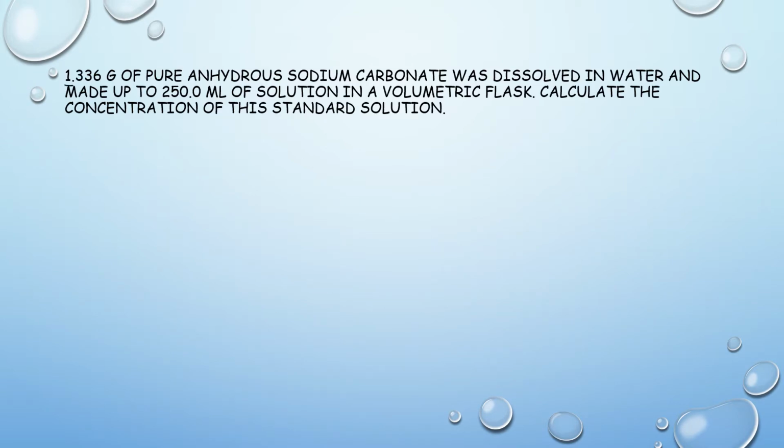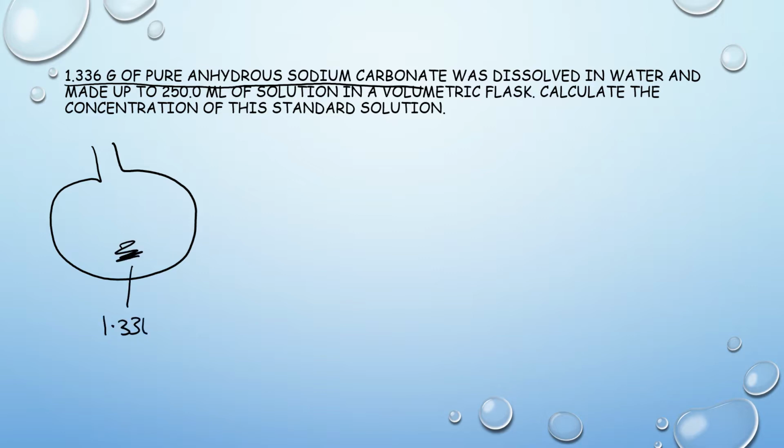So in this procedure, we're going to dissolve 1.336 grams of sodium carbonate in distilled water and make it up to a volume of 250 ml.